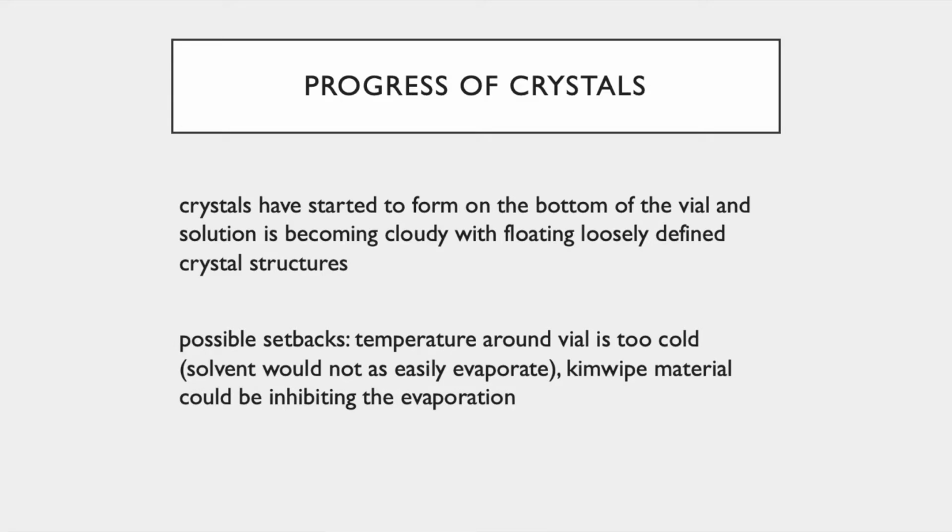First, I'm going to talk about the progress of my crystals. A small collection of crystals have started to develop at the bottom of the vial. They look well formed and clear, and the solution has also developed a cloudy quality to it that I think is an indication of other crystals forming. After this slide, I've also included a video of a 360 view of my vial.